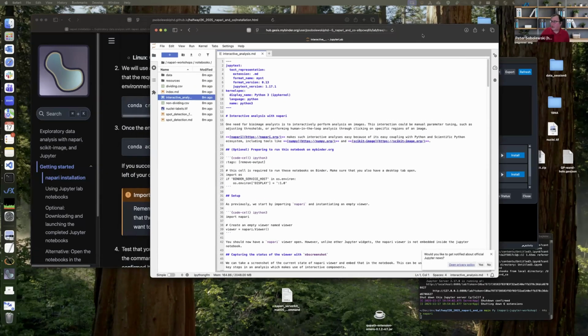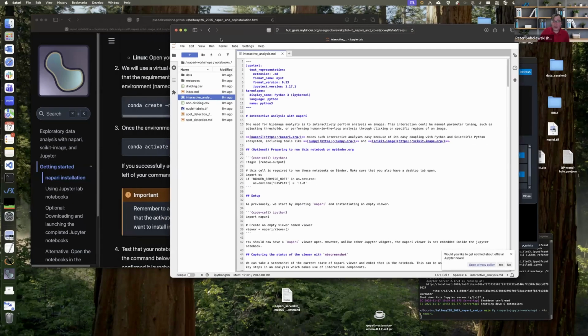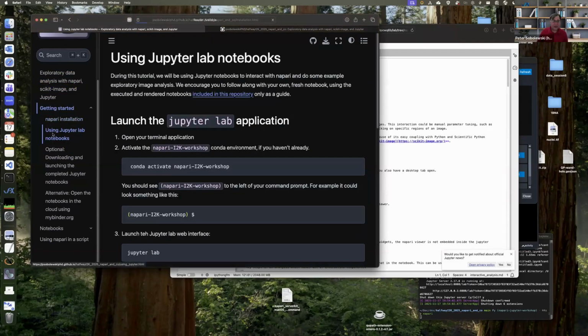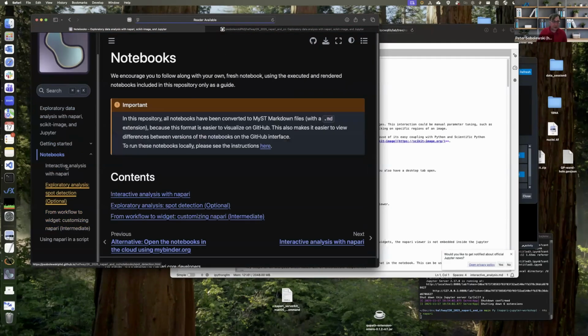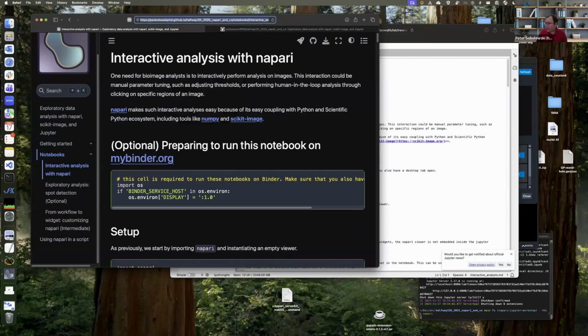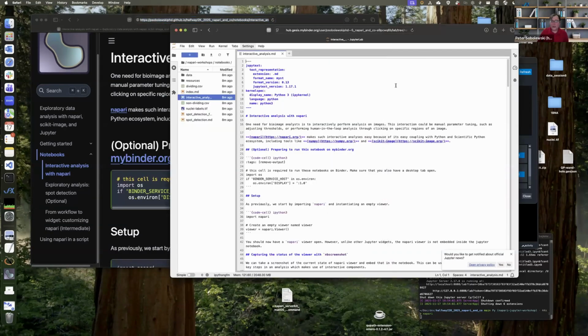All right. So Binder has launched. So if anyone wants to try to use the cloud platform, you can certainly do that. You need to go to this page, and I'll put it in the chat. If anyone wants to use the cloud platform, you would go to this web page and then click the Binder button here at the top, the rocket. And that will launch this interface, which is exactly the same as what I'm going to be doing.